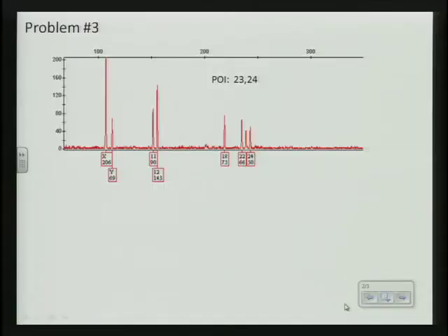Okay. But would you accept I have got a significant peak at that point? And it's significantly above your noise level? Okay. So the question is whether that's an allele or not. But anyway, I'd be happy to accept it. There we go. So we've got a person of interest in this instance of a 23,24.